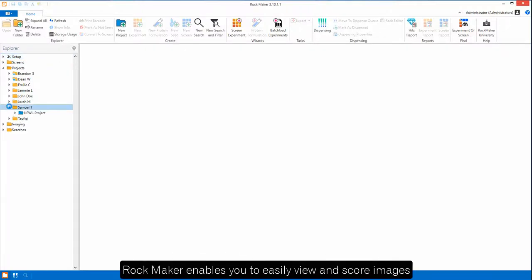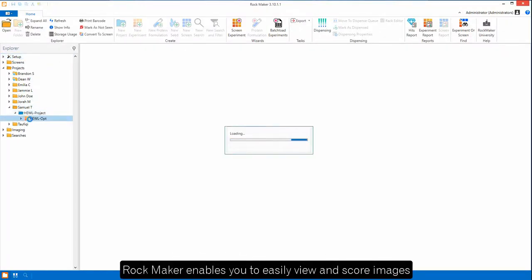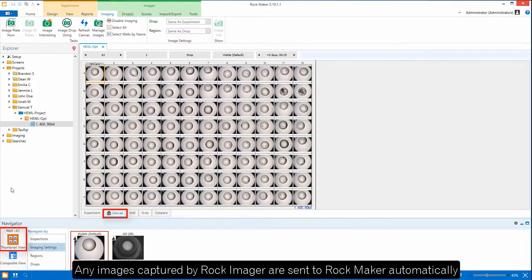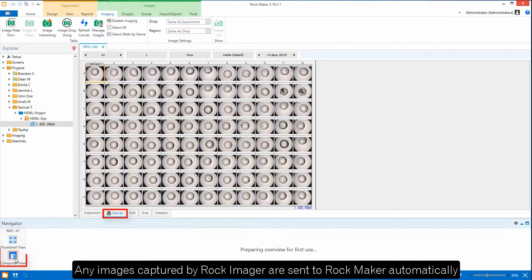With RockMaker, viewing and scoring images is easy. Just click on an experiment to see your images sent automatically from RockImager.